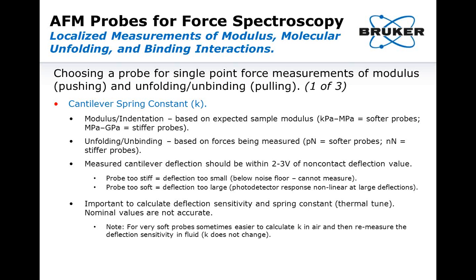When performing these measurements, we have many of the same considerations that we did for QNM. We want to choose the cantilever spring constant based on the expected stiffness of the sample for modulus and indentation measurements, and on the expected binding energy for the unfolding and unbinding measurements.